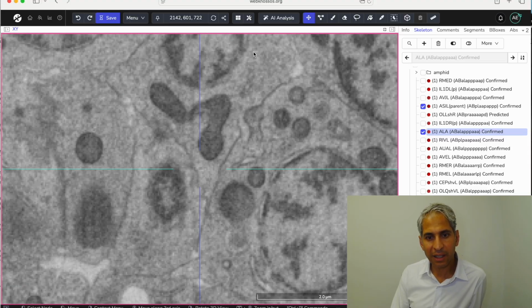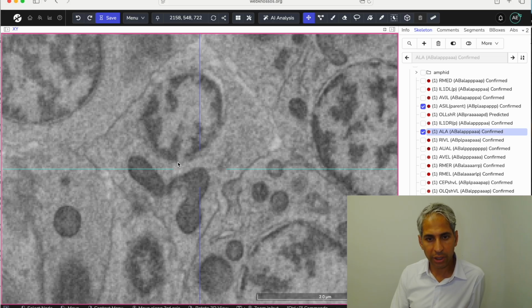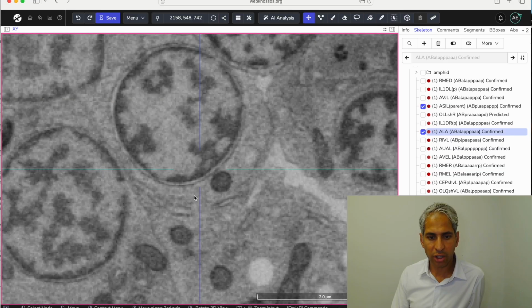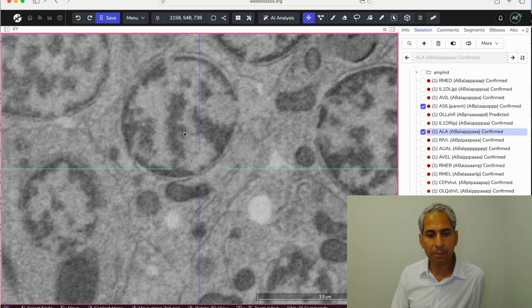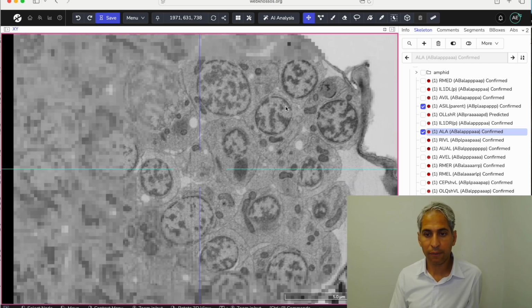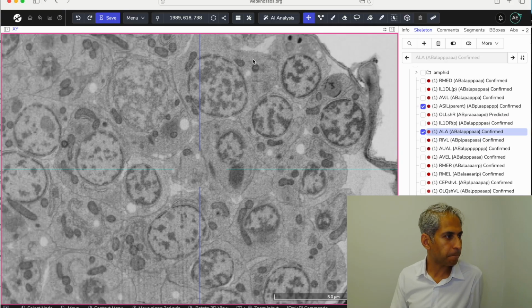And then in the cell next to it, let's drag this. Here's the nucleus, easy peasy. This I would say is mitochondria with a very interesting noodly shape. Some of you will have more than 10 mitochondria. Some of you may have a few mitochondria. The number of mitochondria is a feature of your cell I want you to report on in your reflection. That was a neuron. Let's look at the chat.